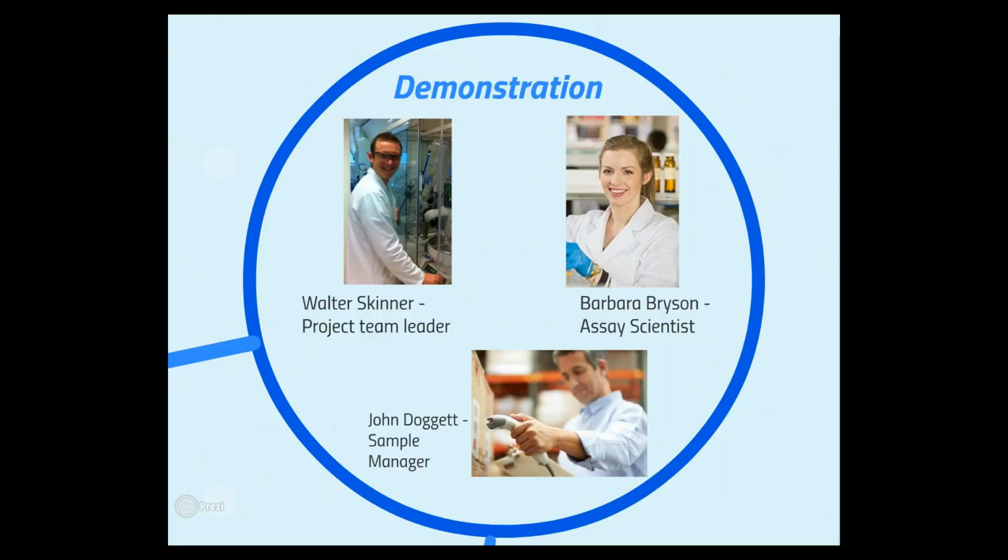So what I'm going to do now is give you a demonstration of the system, and we're going to run through the workflow. The example I'm going to give you is very much going to be a sort of manual running of the workflow, but there are many opportunities in there to automate the steps, either directly or through integration with robotic systems, etc. So these are the three characters that we're going to be talking about today.